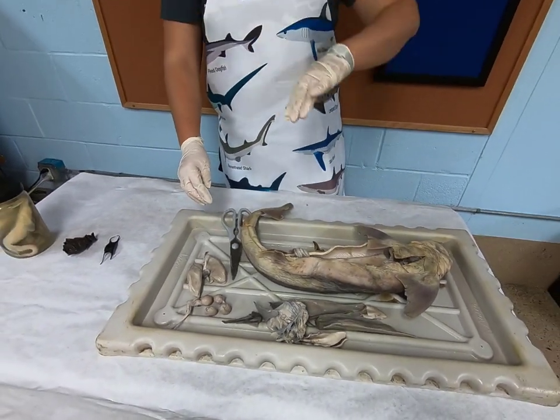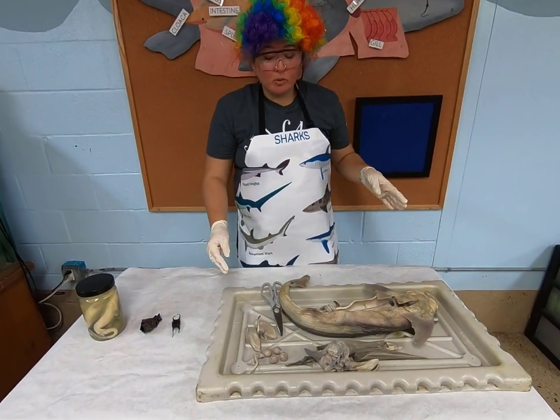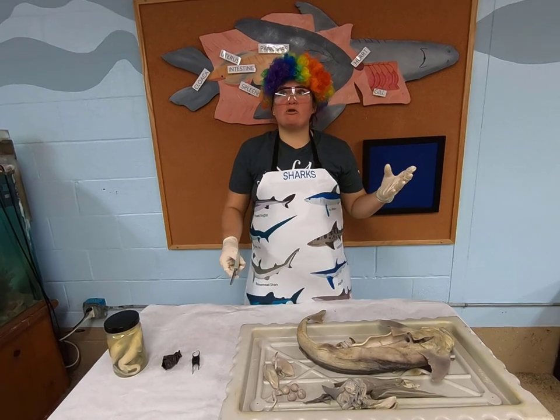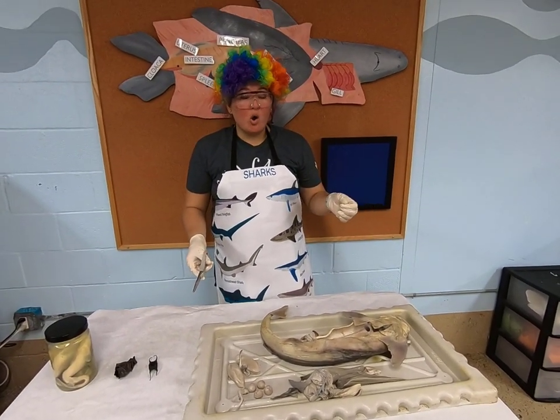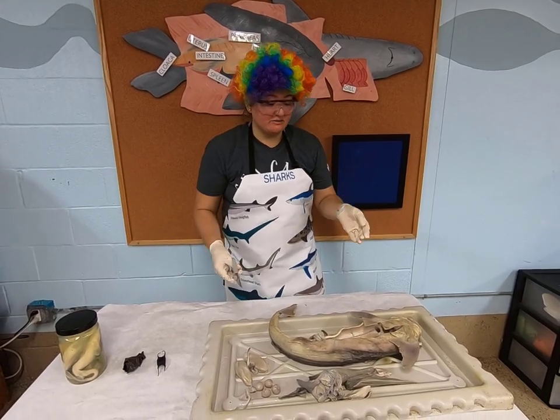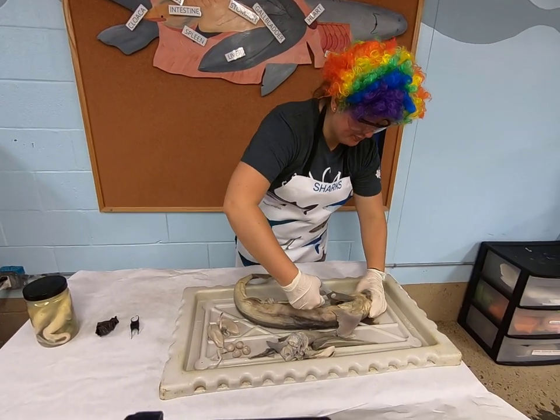So let's see if we can find the shark heart. Now before we do it, I want everyone to think in their brains and guess the size of their shark's heart and either draw it on a piece of paper or just look at your hand and try to guess the size, because it might surprise you.